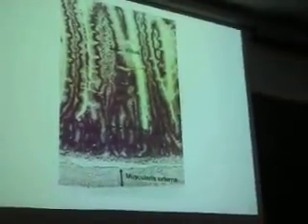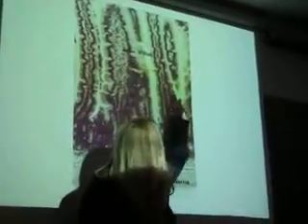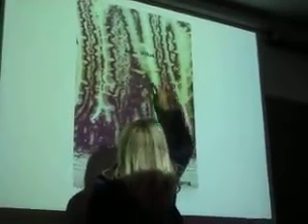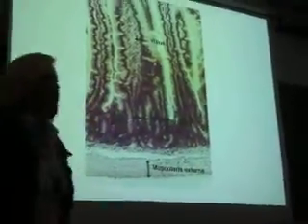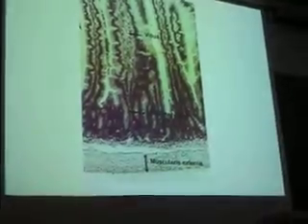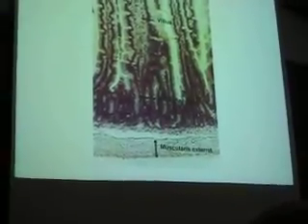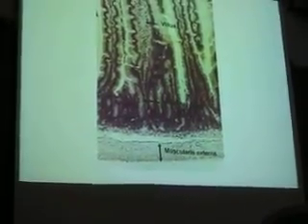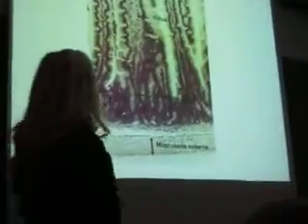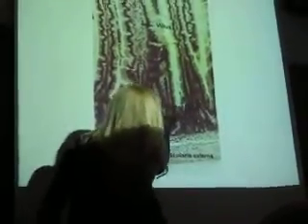Embedded between those cells are going to be, well, you can't really see them unfortunately, you kind of can. What are these things? Those little white wine glass shaped structures. Not between the epithelial cells up there. They're goblet cells, absolutely. So the goblet cells are secreting what? Secreting mucus.